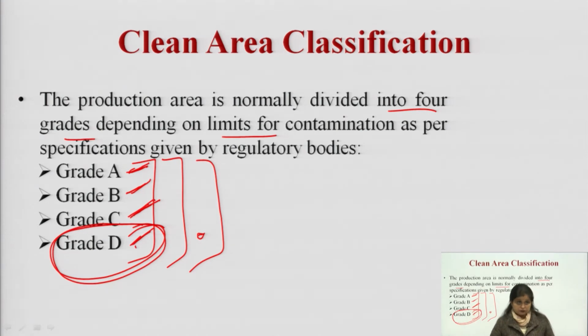grade A. Grade A is the aseptic area, which is required for preparation and for the packaging part. Sterilized formulations can be prepared only in an aseptic area, the area which will be free from microorganisms, free from particle contamination, free from dust particles.